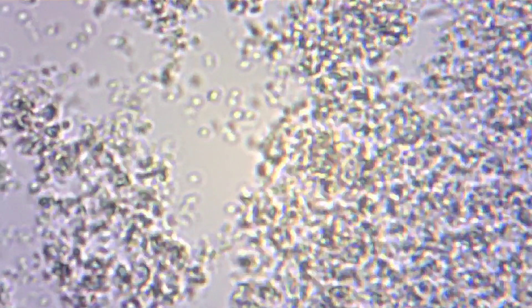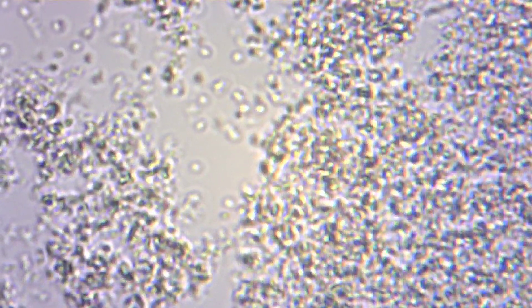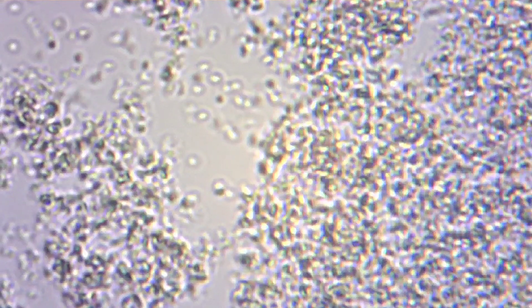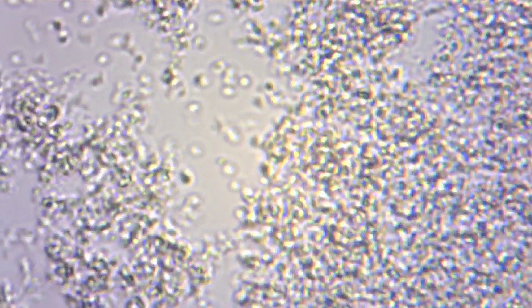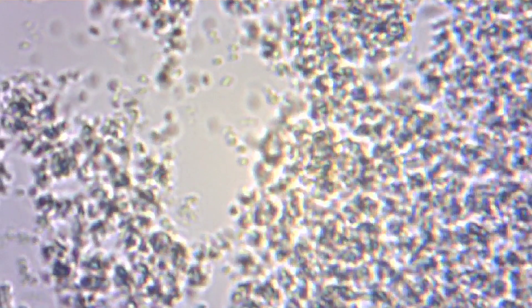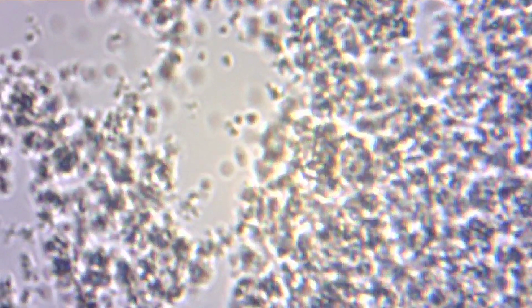I'll try focusing it a little bit, but with how small this is and the magnification I have this set at, focusing is near impossible. So that's that — that's what's in your yogurt. Enjoy.